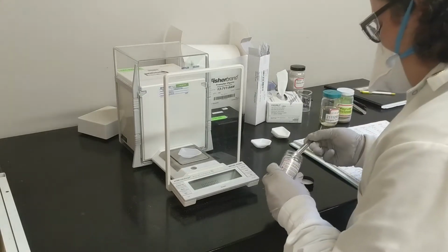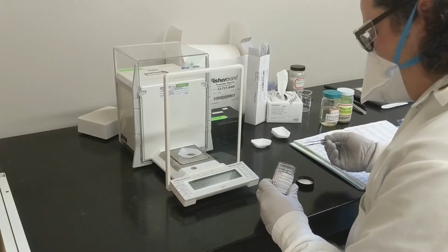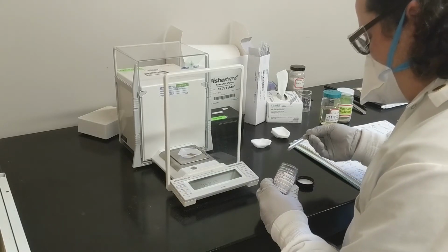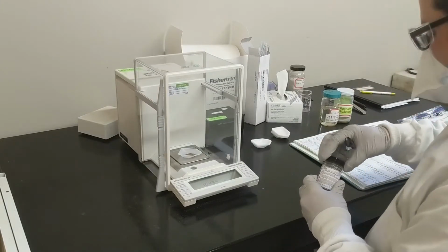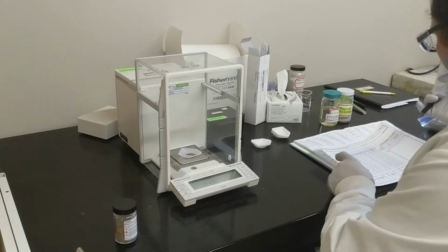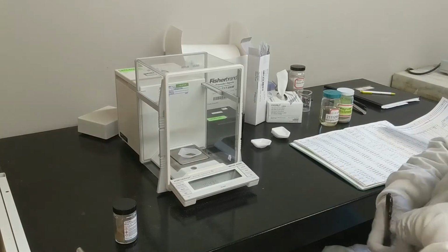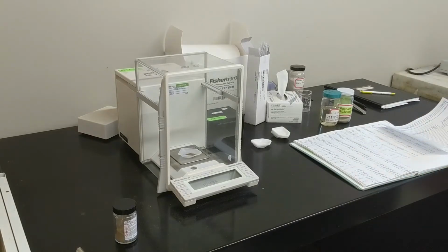We have 3 different digests that we do, but they all start basically the same way, with weighing out sample. The main difference is in the masses. So for our atomic absorption samples, we usually weigh out 1 gram. For our ICP OES samples, we usually weigh out between 0.25 and 0.5 grams. And for our ICP MS samples, we usually weigh out 0.25 grams. But generally, we're weighing somewhere between 0.1 and 1 grams.